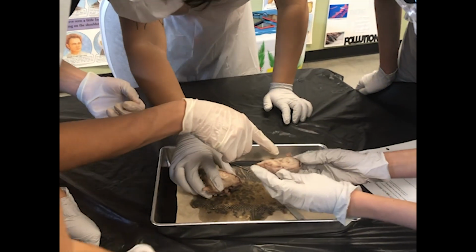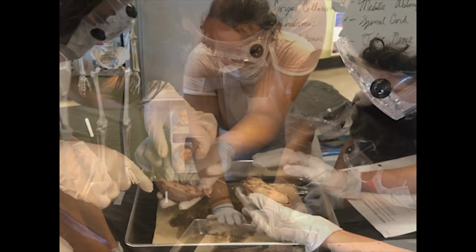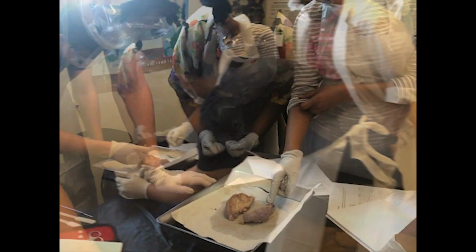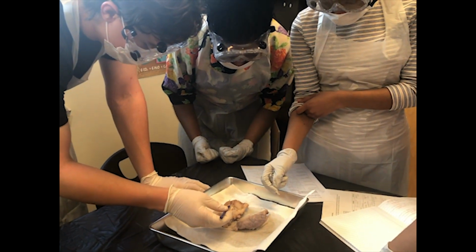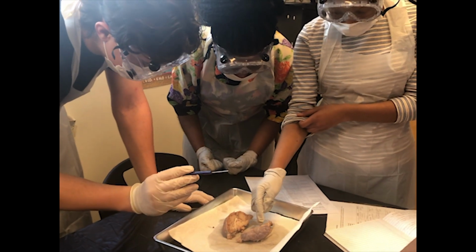And you can see the ventricles. So this would be the... Oh, that's ventricles right here. How about here? Corpus callosum. Let me be specific. It's above, at the top of the brain, sir. Is it this right here?